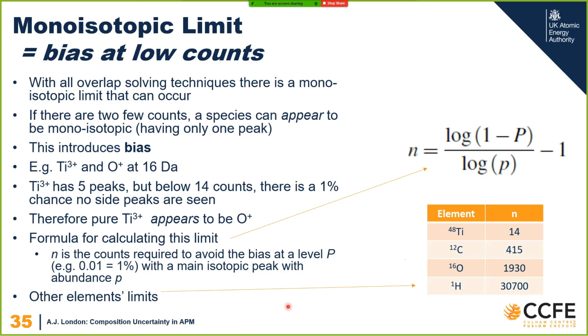So let's pop back. Let's talk about bias for a moment. This is not unique to.